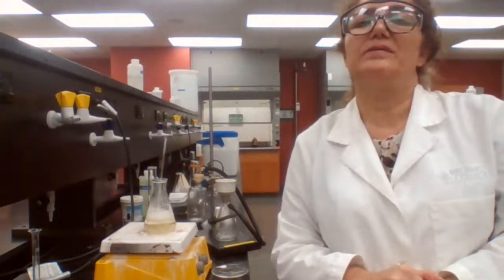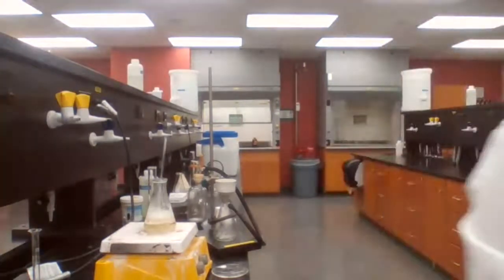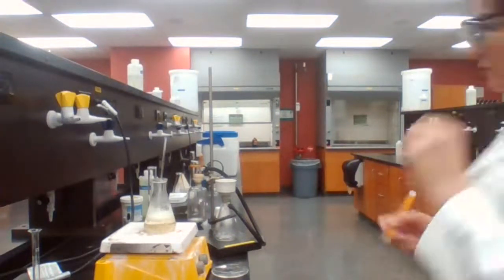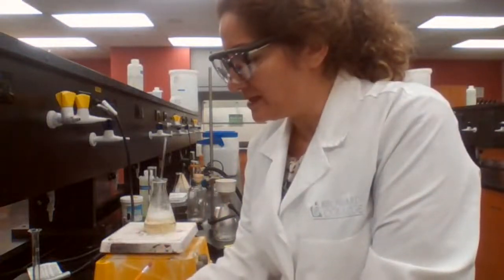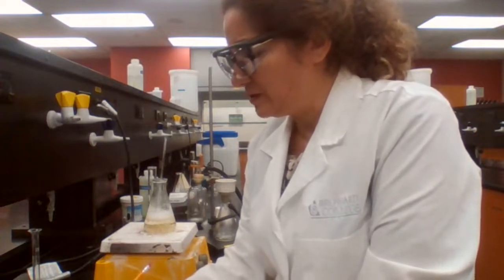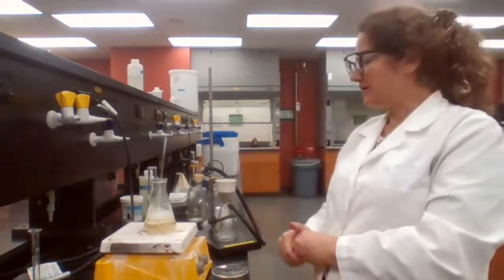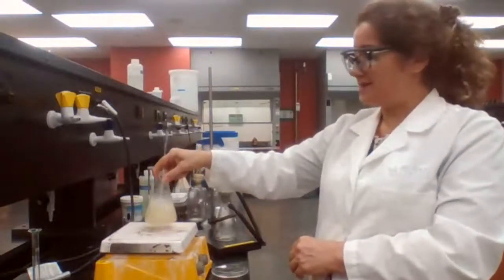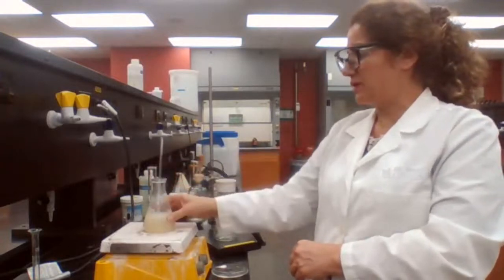That is the same mass of the aniline? No, it's just the empty filter paper and the watch glass. We don't have the mass for aniline. Instead of the mass for aniline, we used 4 milliliters. And if you check step number 1 in the procedure, it is asking us to use the density, which is a literature value. You find the density for aniline, and you convert the volume to mass. Multiply the volume by density, that gives you the mass for the product.